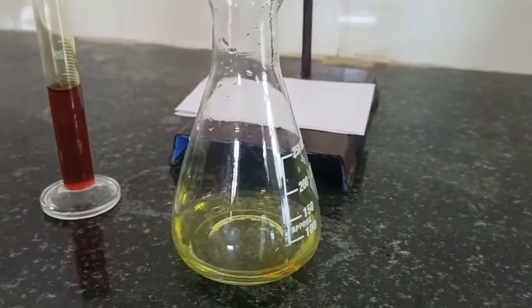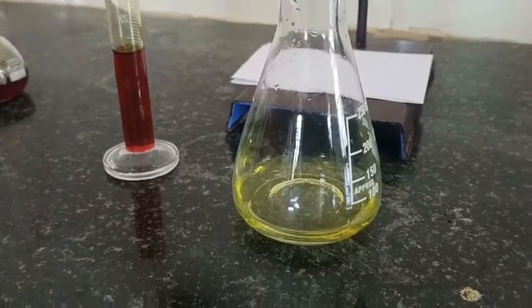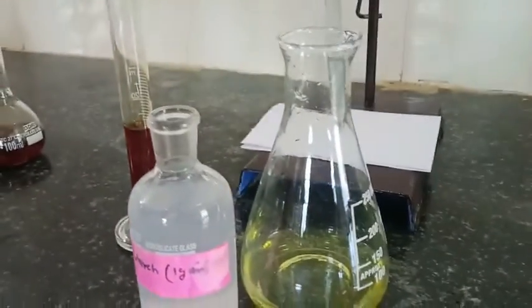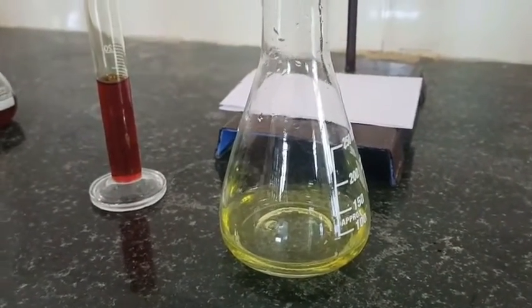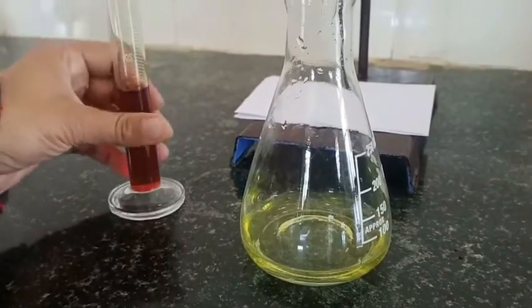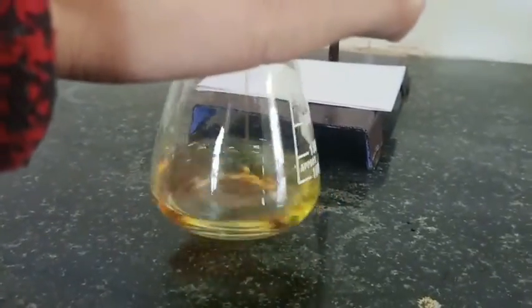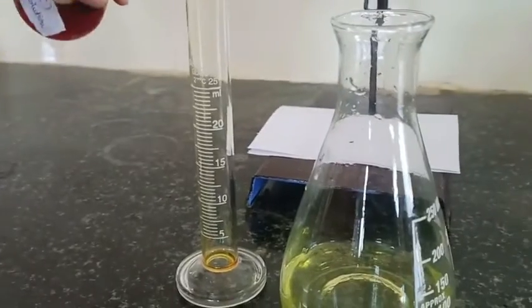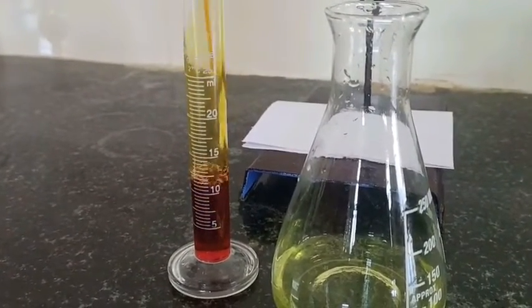After adding some iodine solution, or previously, you can add starch solution to this, so that you will get a prominent color of the iodine starch complex once the reaction between iodine and vitamin C is completed. So here we are seeing this 25 ml of iodine solution reacts with the vitamin C solution and still no color has appeared.